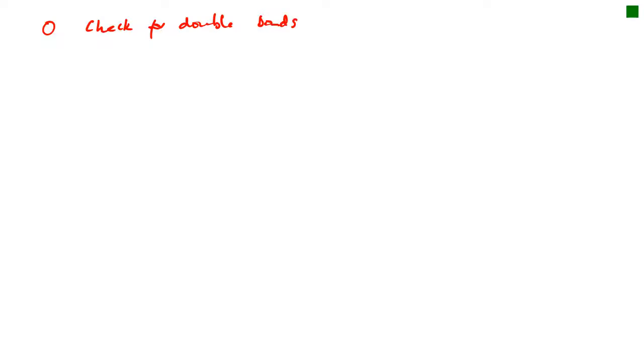Now, when I learnt about NMR, I learnt something called hydrogen deficiency index, which is not in your spec. So we're not going to do hydrogen deficiency index, but what we are going to do is what I did in the worked example number 1. I just had a look at the general formula for an alkane. If you remember, that's CnH2n+2. Because if it just does happen to work out that the number of hydrogens is twice the number of carbons plus 2, then it tells you that there's no double bonds.